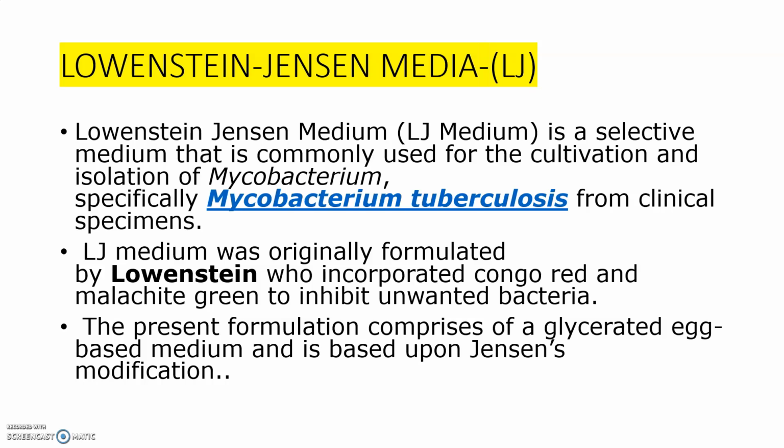Next is about Lowenstein-Jensen medium. Lowenstein-Jensen medium, which is also known as LJ medium, is a selective medium that is commonly used for the cultivation and isolation of Mycobacterium, specifically Mycobacterium tuberculosis, from clinical specimens.